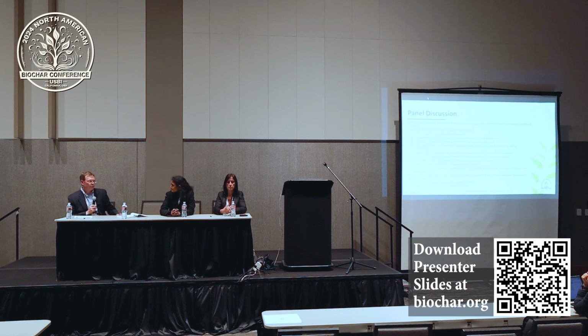So I'm going to go back to the first part of your question, why are there so few laboratories? And it's simple. It's getting handed this as a laboratory, from our perspective. So somebody comes to us and says, here's the IBI standard, can you do this testing? Oof, boy, I tell you, it's a real sigh when I look at it. It's a conglomerate of several different industry standards pulled together for the purpose of classifying biochar, but there are compost methods in there, there are charcoal methods, there's solid waste methods, there's research methods that reference individuals.